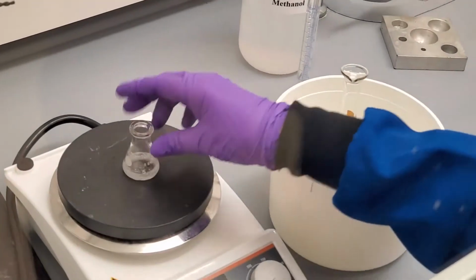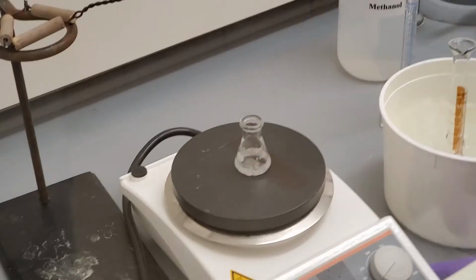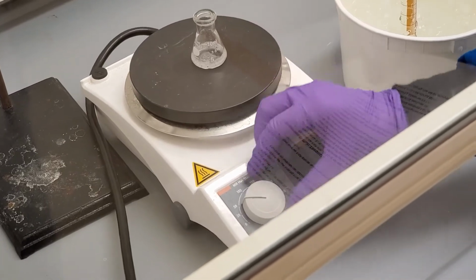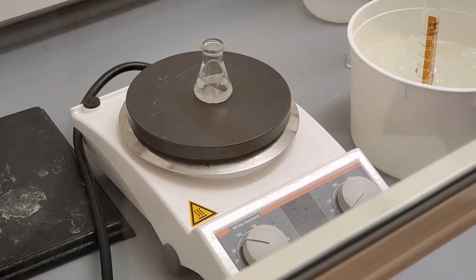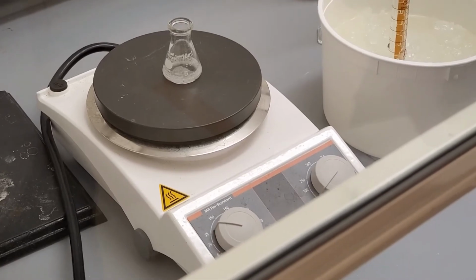Now that all of the reducing agent is added, we turn on the hot plate and set the temperature dial to about 60 degrees Celsius. We allow the reaction to gently boil for 3 minutes. If you notice the solvent level getting too low, add 0.5 milliliters more of the methanol. We did not have to do this in our reaction.